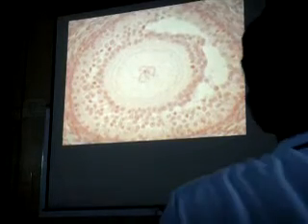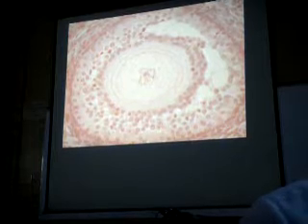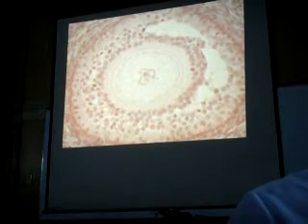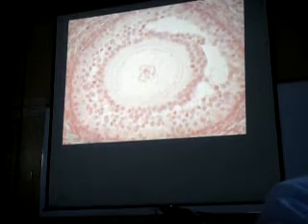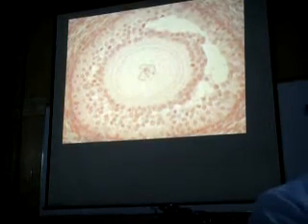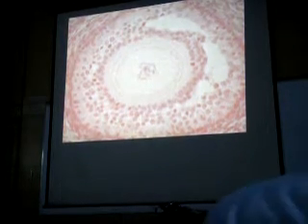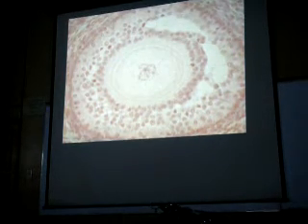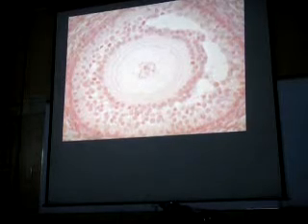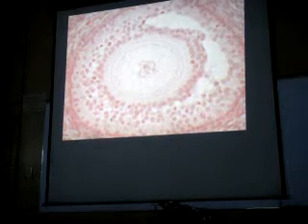But under light microscopy, sometimes you will see all the nuclei of the cells and you just have to imagine that there are what? Cell membranes separating one cell from the other. So when we say columnar cell, it's a tall, elongated cell. The nucleus is what? Usually oval or spherical, sometimes flattened, especially if it's mucus-secreting, and it's pushed towards the base of the cell. So here, how would you classify the tissue? Classify pointed tissue, be specific.